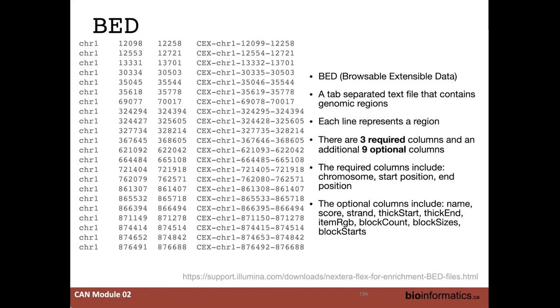But on the flip side, I told you before that this one's from an exome capture. Because you're only sequencing certain segments of DNA, having all the rest is great, but does it really give you any information? So you'll want to look at the ones that were specifically captured. Not to say that the non-specific captures you get might not be interesting, but most of the time you'll be dealing with just those regions that they give you.